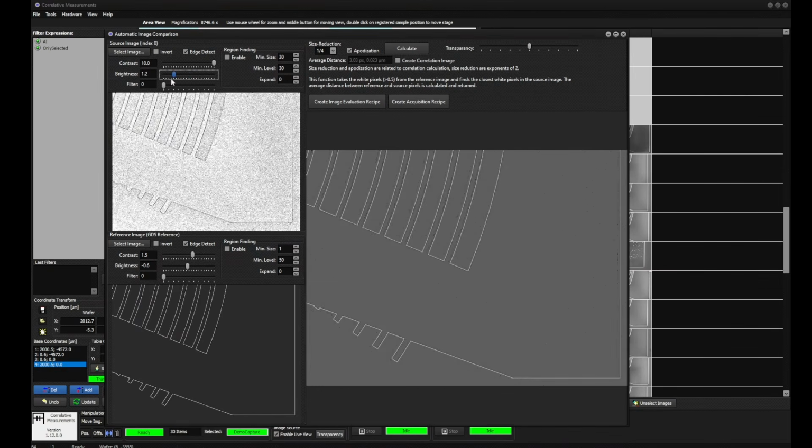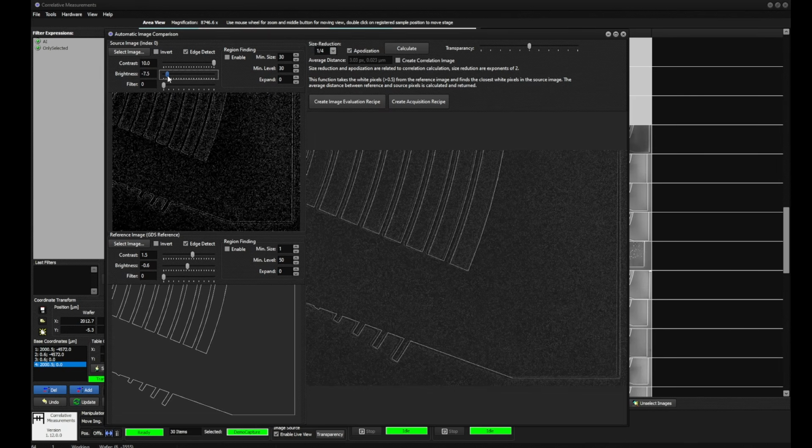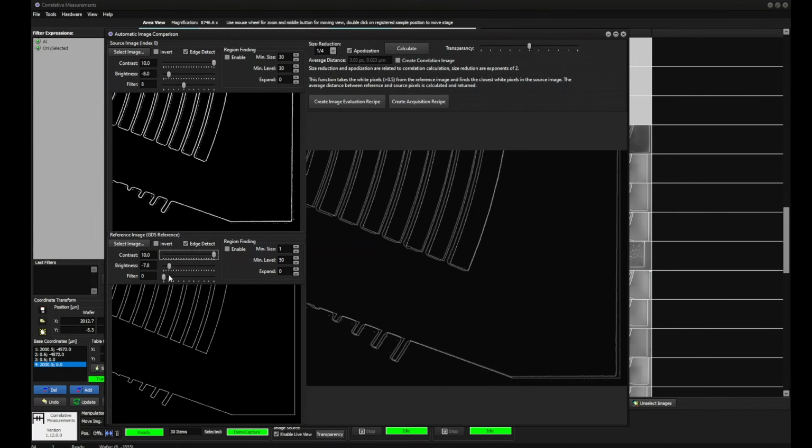If you just increase the contrast and make edges, you get a very noisy image, and that makes no sense. So you nearly always need to filter it like this, and then you get nice lines. You can easily do this on the automatically GDS-created image, because this is pixel-wise perfect. Here it's just subtracting 2 pixels and you get the edge.